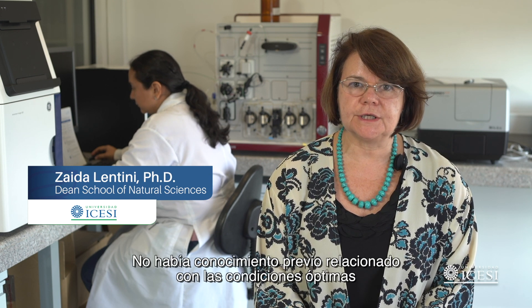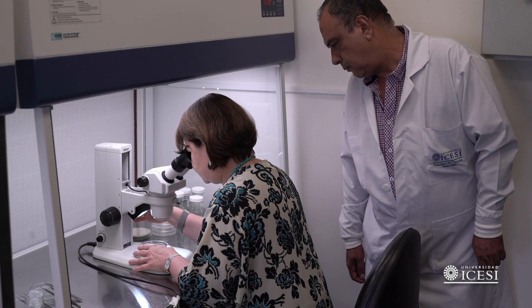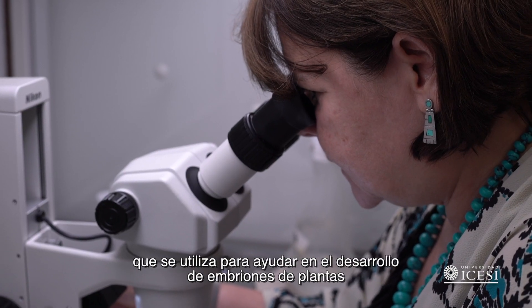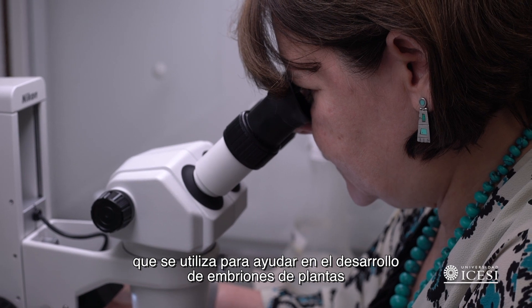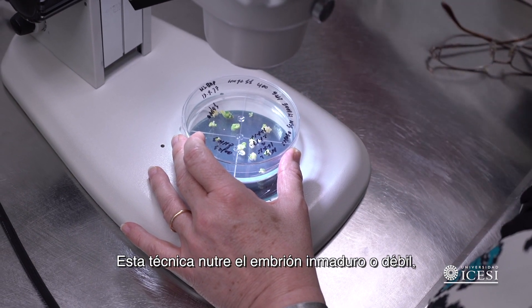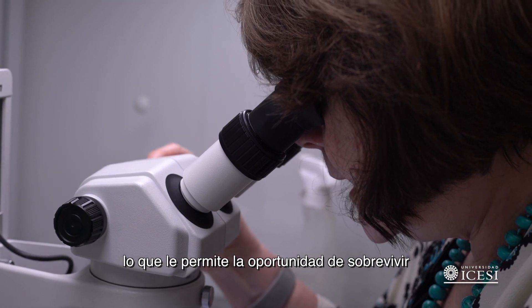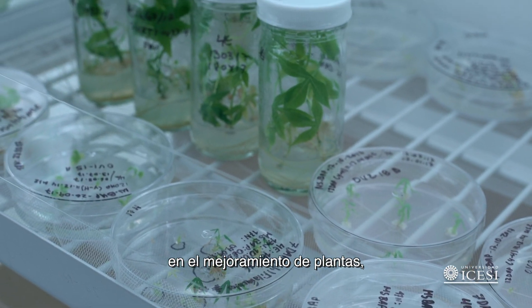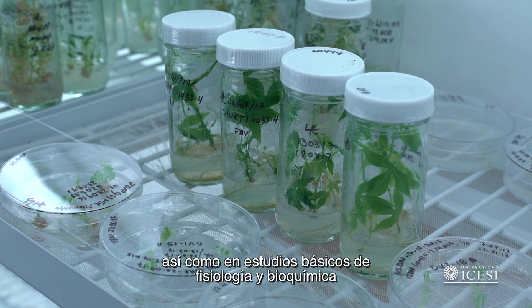When we started working on the development of double haploid technologies for cassava, we encountered a major bottleneck: there was no previous knowledge related to the optimal conditions to induce embryo formation in vitro. Embryo rescue is one of the earliest and most successful forms of in vitro culture techniques, used to assist in the development of plant embryos that might not survive to become viable plants. This technique nurtures immature or weak embryos, allowing them the chance to survive, and has many significant applications in plant breeding as well as basic studies in physiology and biochemistry.